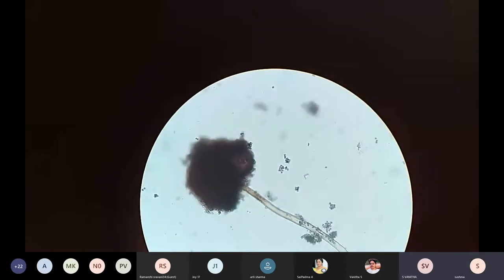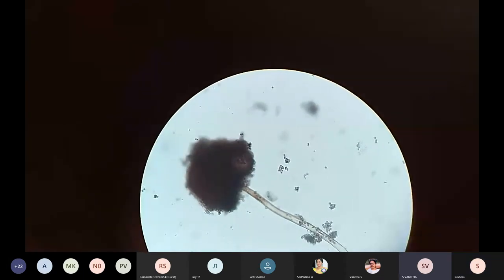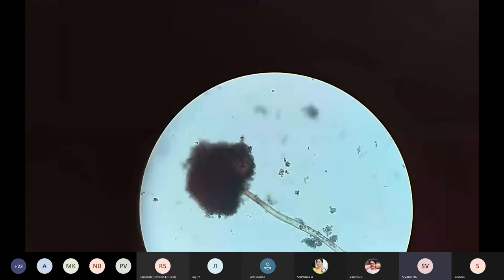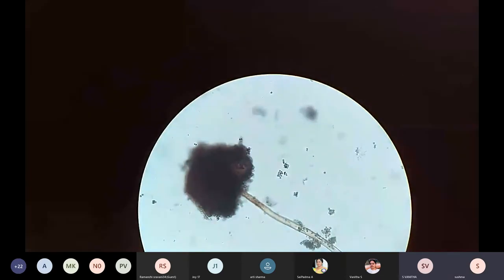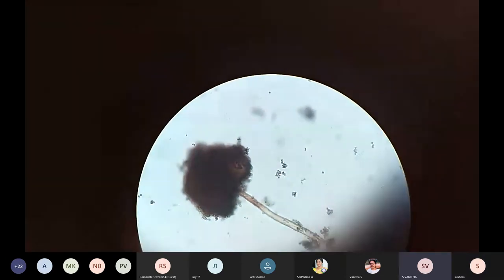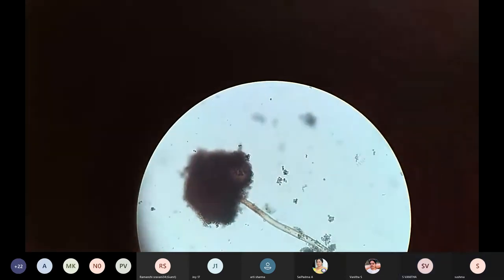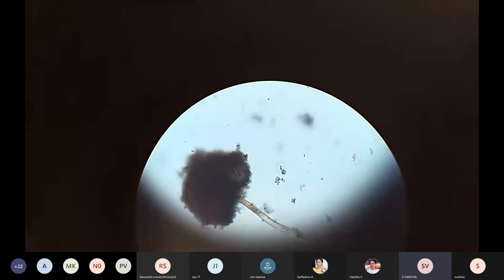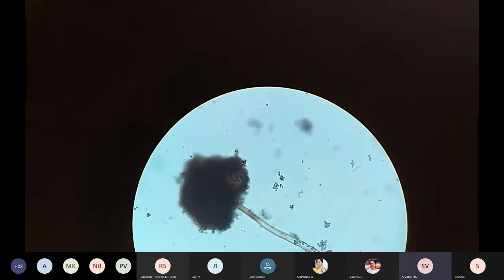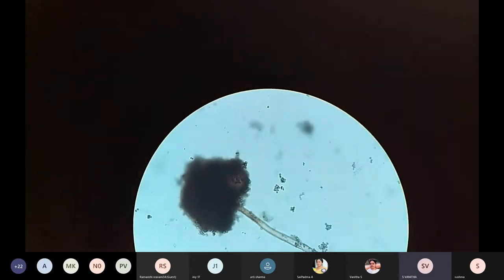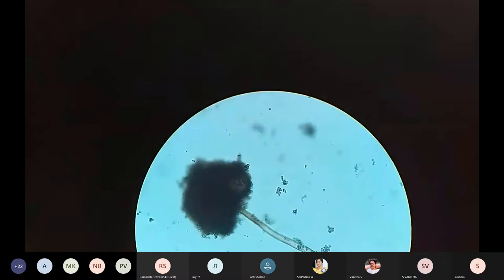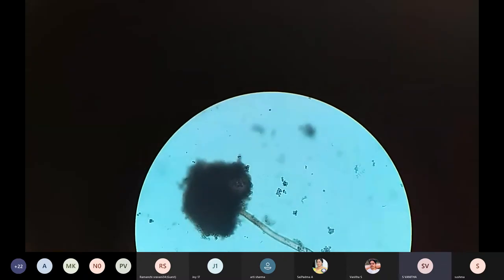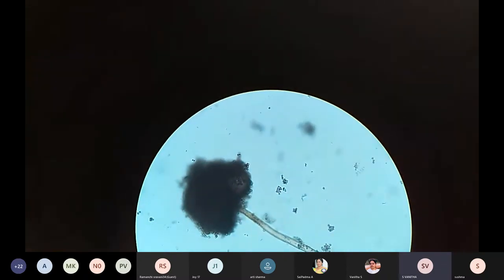You can see the hyphae. Single it is. There are no many branches also. Very clearly it is seen. Okay. So you can, for the exams, this is for test. We will give you. So you should be able to identify them. Shall I go to the next slide?